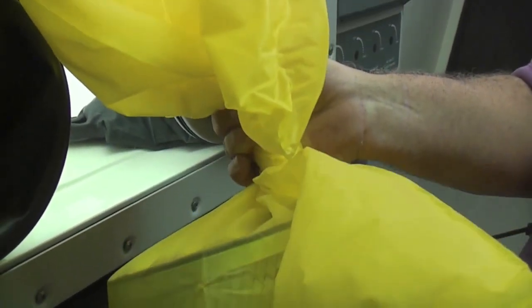The HEPA or ULPA filters can be easily removed by hand or they can be removed using a bag-in, bag-out filter disposal method allowing for safer filter replacement.